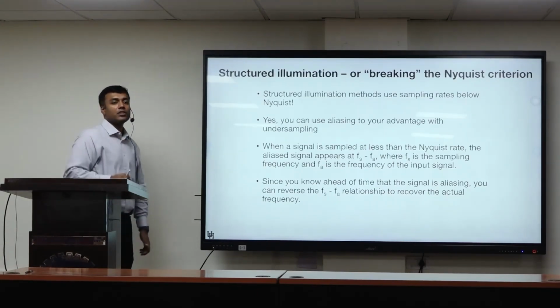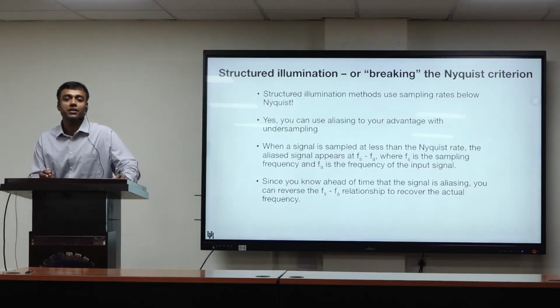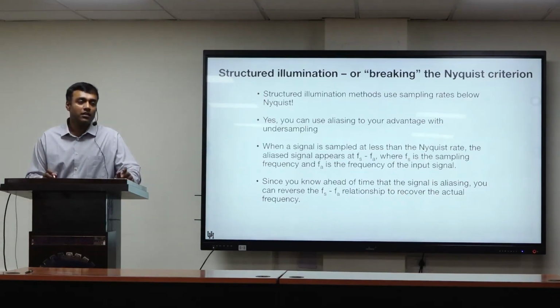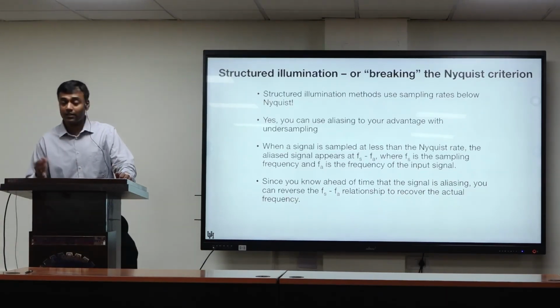So is it possible? For about 100 years... the person who figured out the diffraction limit was a scientist by the name Abbe in the 1800s, and Carl Zeiss. Zeiss was a German who started a company to make microscopes, and they were trying to make better and better microscopes and figure out what's the limit of the best we could do. Even today, the company exists.